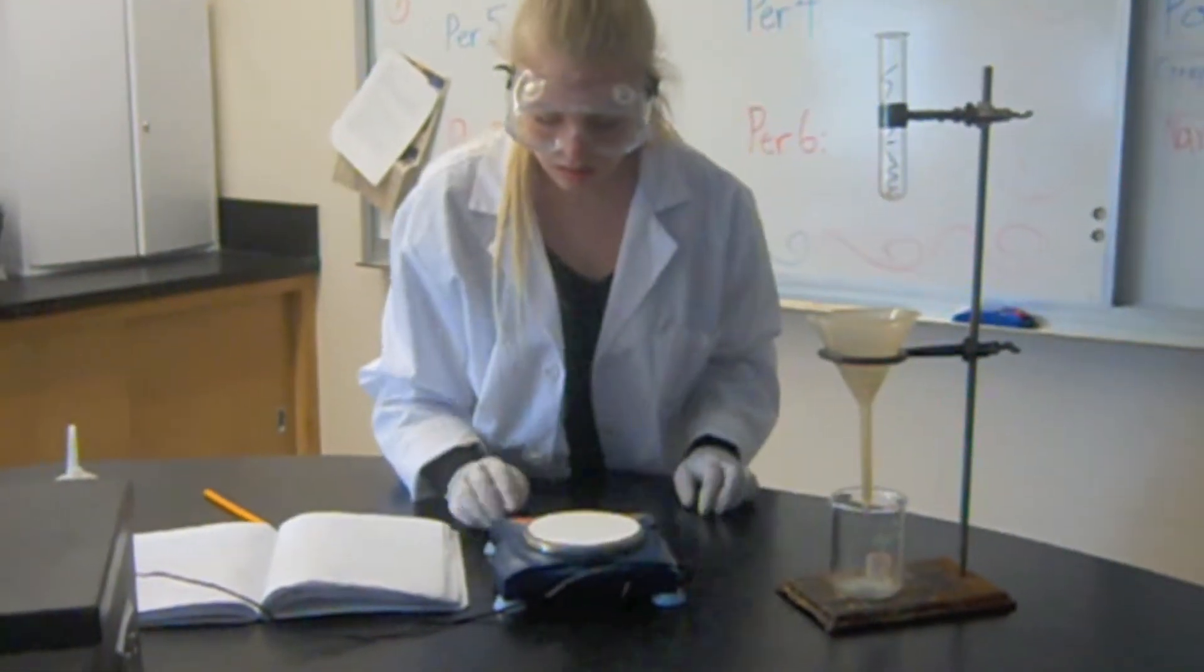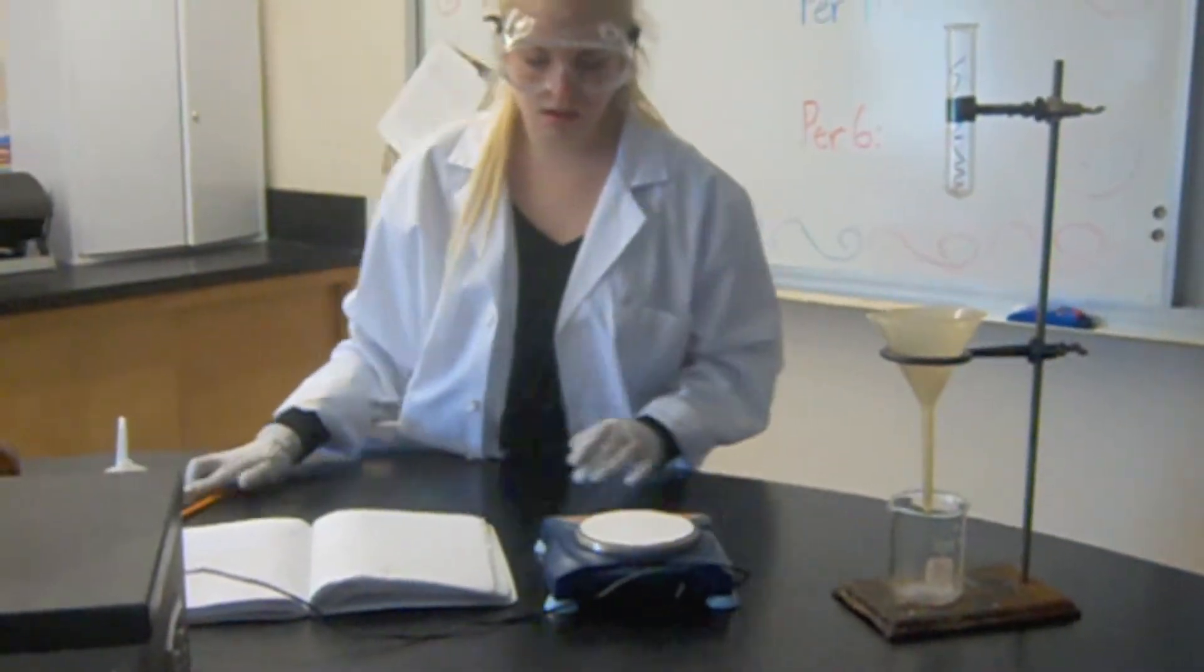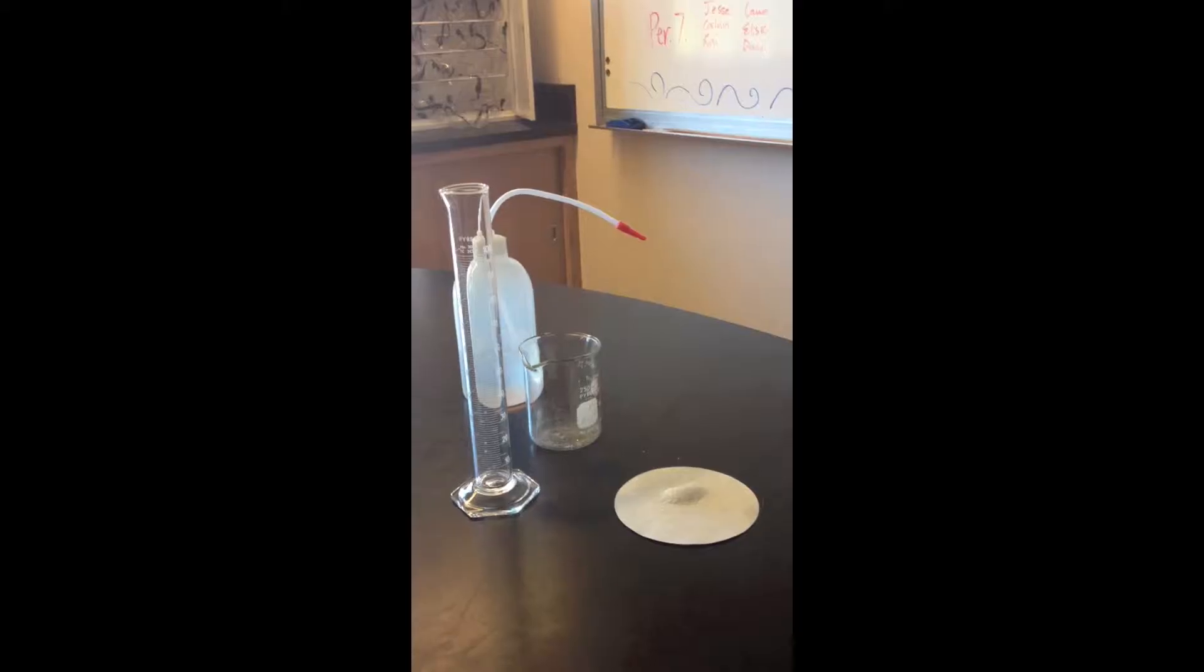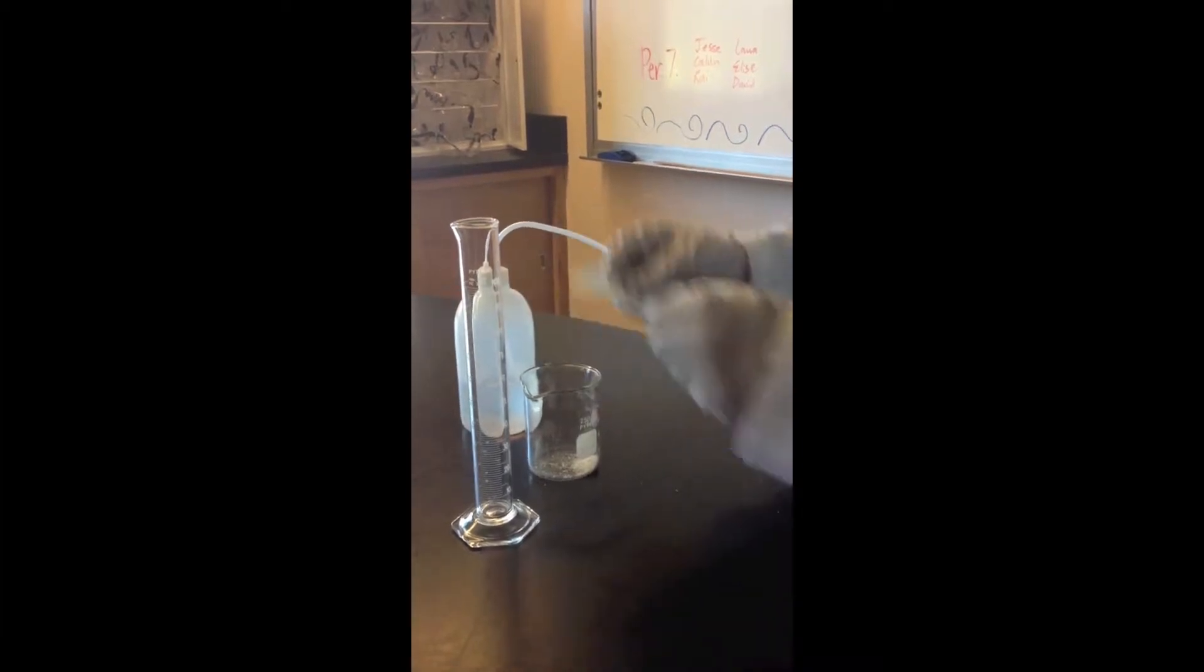Weigh a clean sheet of filter paper. Collect about 1.5 grams of Silver Nitrate on the filter paper. Pour the Silver Nitrate into the beaker.